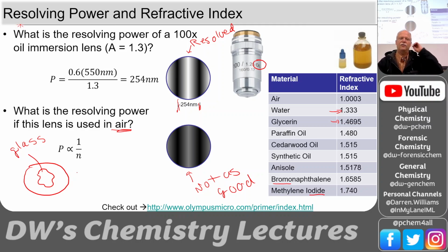Okay, so that's our glass fragment. We get a picture of it. We can see the outline of it. Why? Well, because when light is going through the glass, it goes at a different speed than light that's going through air. Okay? And so we can see the edges. Right at the edge, some of that light is bent into the glass and some of it goes past in the air. So the edges are viewable only because there's a refractive index difference between the air and the glass.